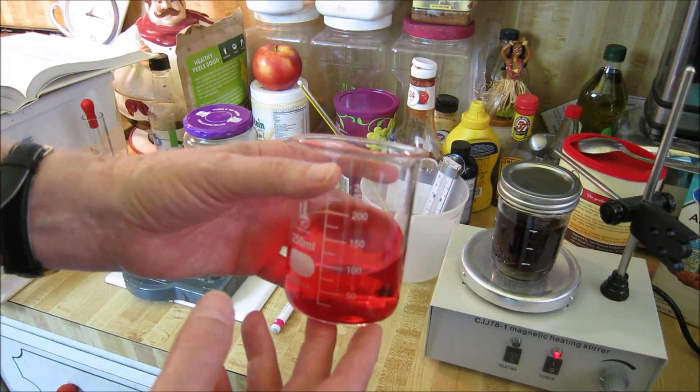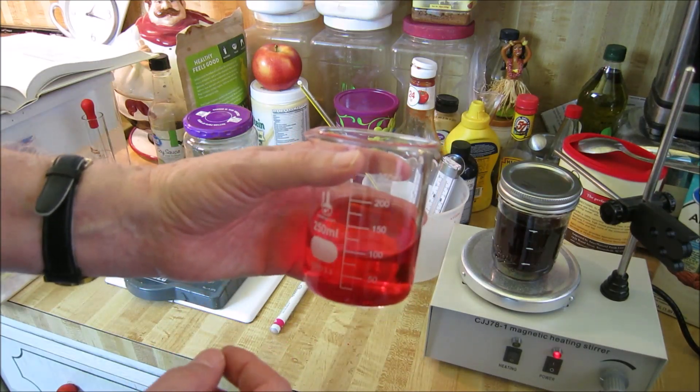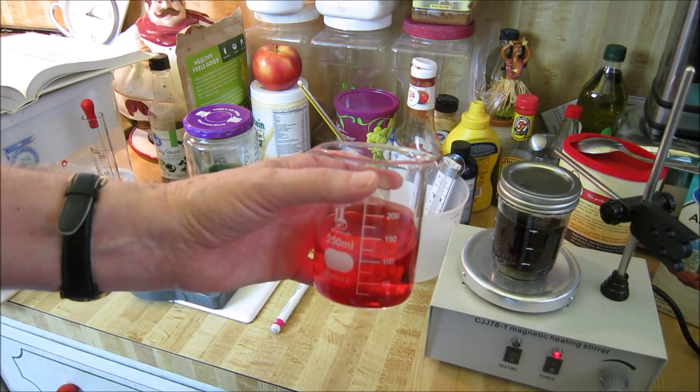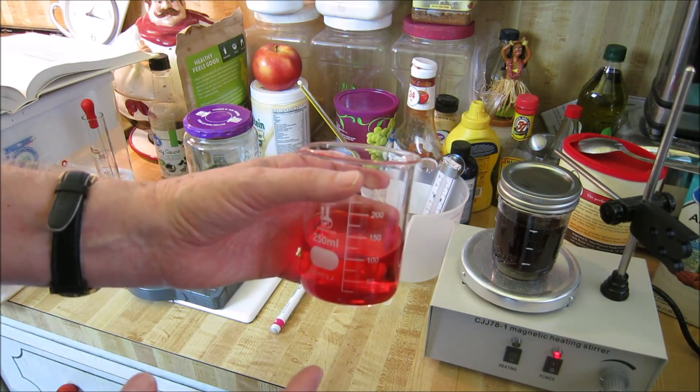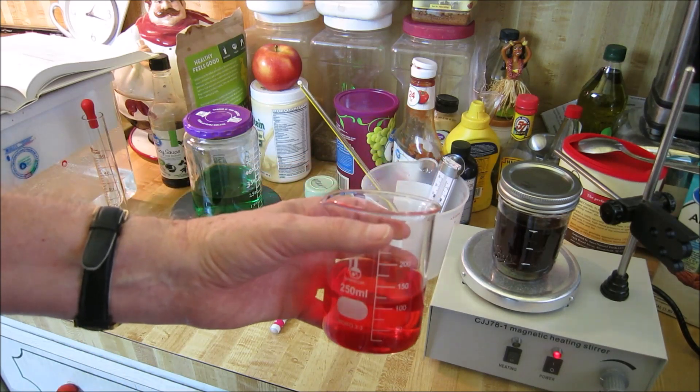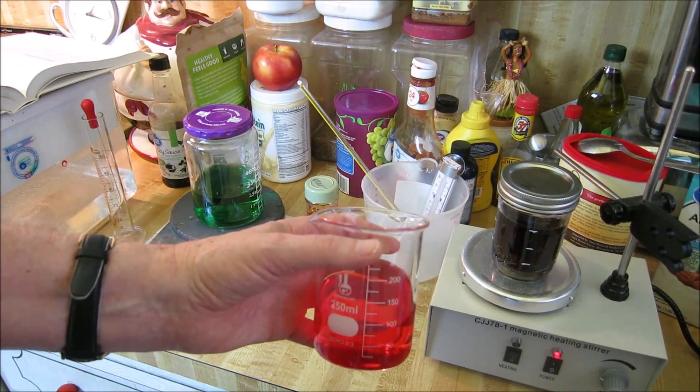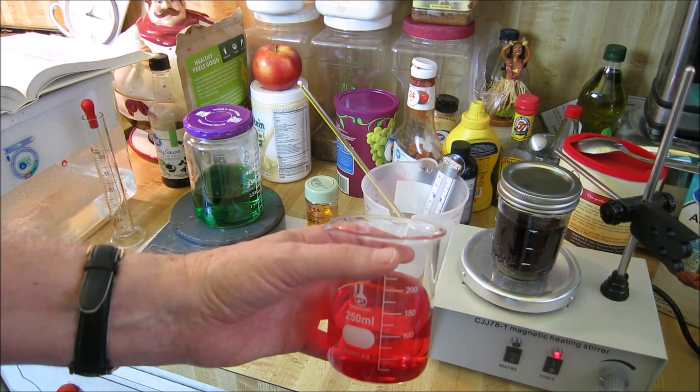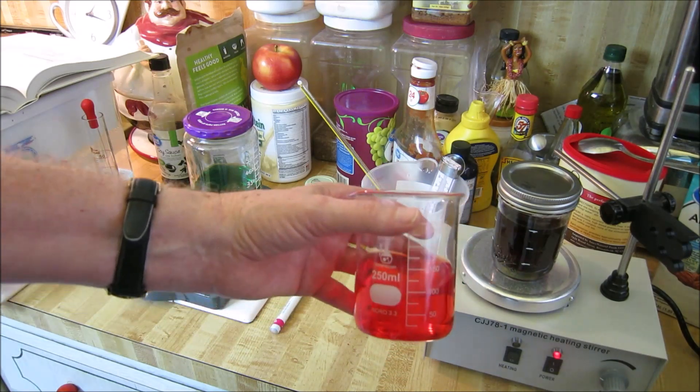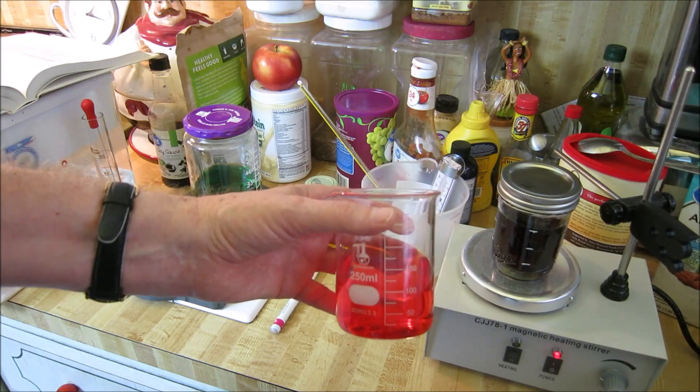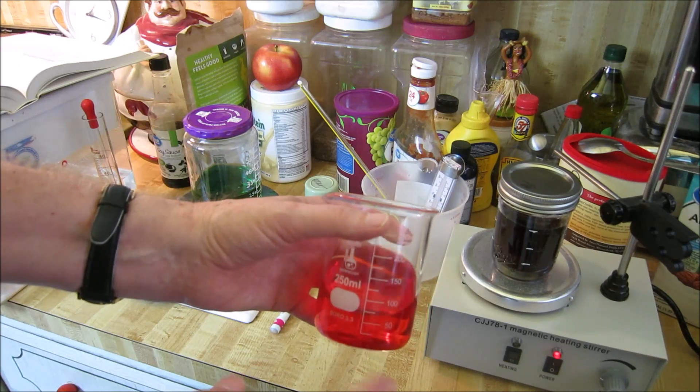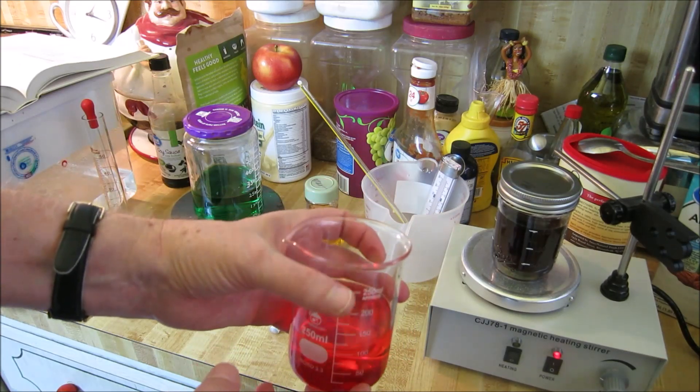However, I have seen in the lab borosilicate glass fracture while it was on the mixer. So anytime you're working with something that if it were to break or fracture or shatter and it would cause a disaster, you want to make sure you have precautions in place. You don't want to have to call emergency or the center for disease control. You don't want to be on the news. You always want to make sure your glassware is protected in a way if something bad should happen to it, even if it is the best glass you can buy. And for laboratory purposes, the borosilicate glass is the best you can buy.